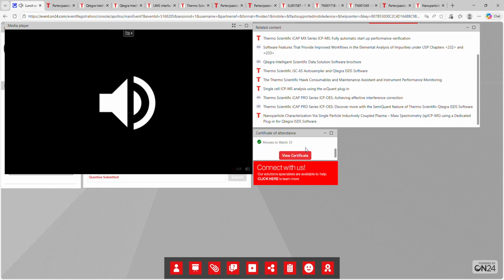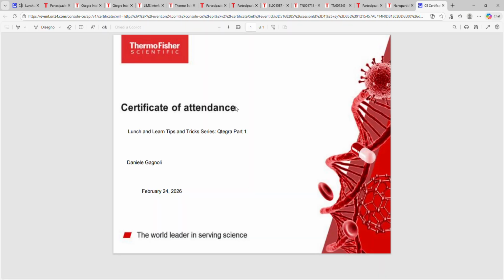Okay. Is there an opportunity of making my ICAP Pro ICP-OES even faster than 3 minutes for each sample?